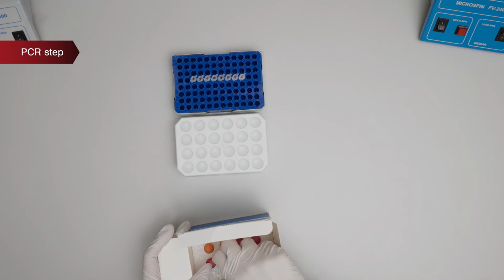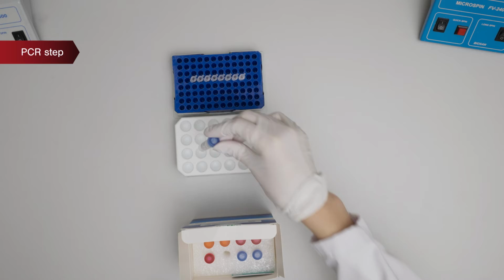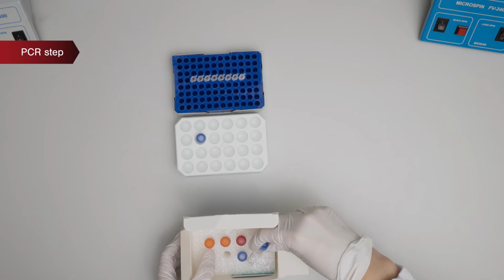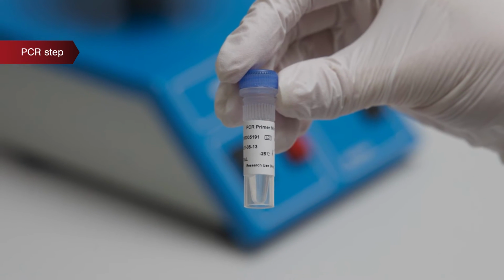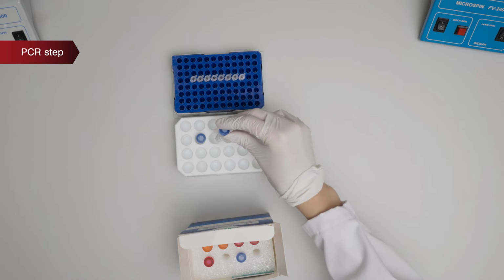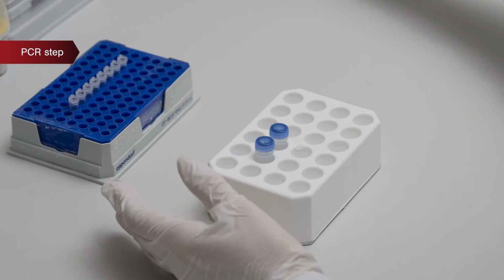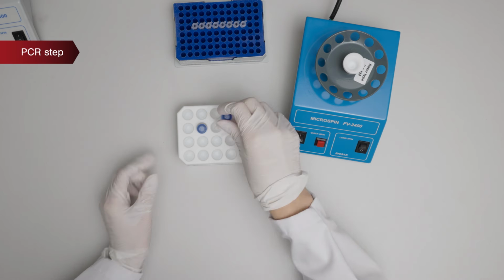Polymerase chain reaction is performed in order to amplify the target fragment. Extremely high fidelity is essential to limit PCR errors that may result in false variant calls in sequencing. During the PCR step, the target fragment is multiplied many times by 3 processes being repeated: denaturation, annealing, and extension.